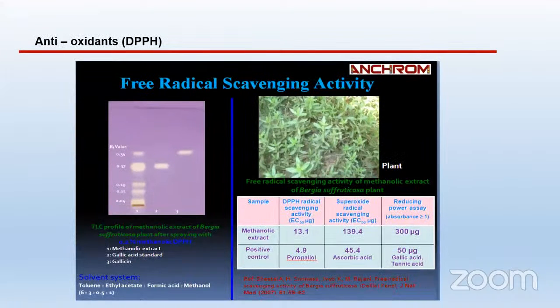One can go for antioxidant analysis as well, which is very much popular nowadays. For that purpose, DPPH reagent is used. Once you do that particular analysis, you can see this purple background on the plate, which is because of the DPPH reagent, and you can see these colorless or yellow colored bands are there, which represents antioxidant activity. There is something in these bands, maybe phenols or flavonoids, which are showing antioxidant activity. That means you can say that the band which is present at this particular RF has antioxidant activity, because it is showing change in color, or it represents the compound which is showing antioxidant activity.